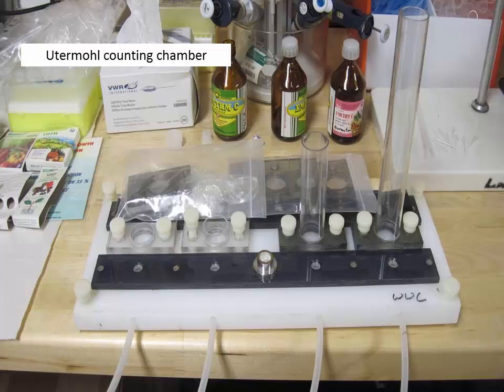But of course most people would put a slight vacuum on it and speed that process up and filter. So that's how you get a standard volume concentrated to be able then to work from that concentrated sample and do your counts and work back to something that says cells or natural units per milliliter or per liter, whatever you're reporting.